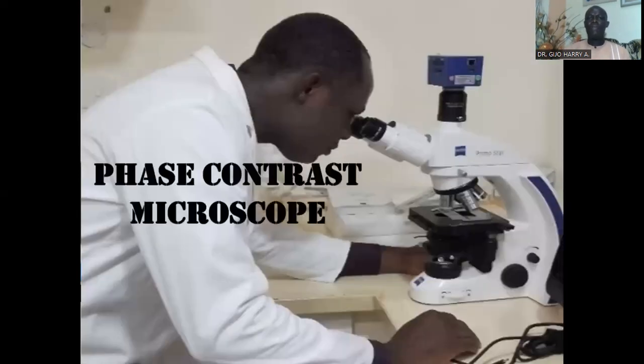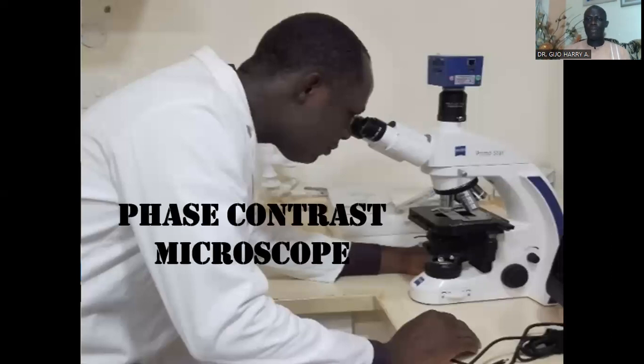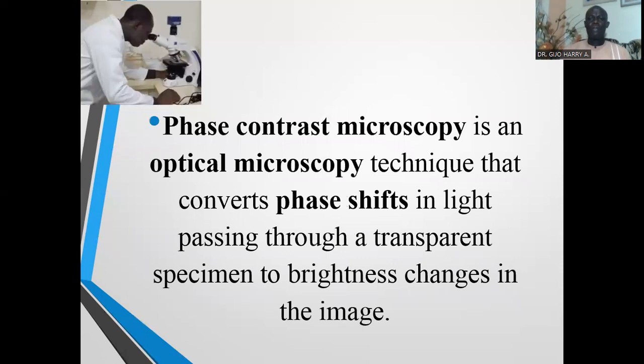Now I want to look at the phase contrast microscope. Phase contrast microscopy is an optical microscopy technique that converts phase shifts in light passing through a transparent specimen to brightness changes in the image.